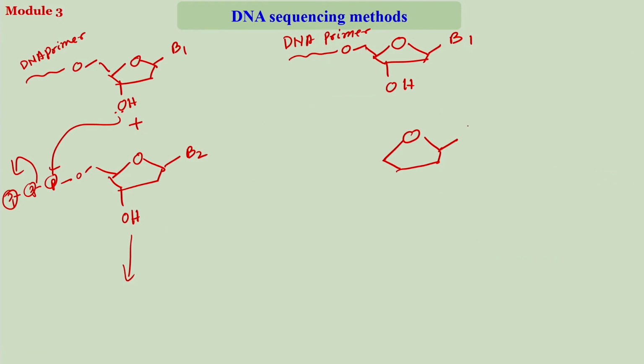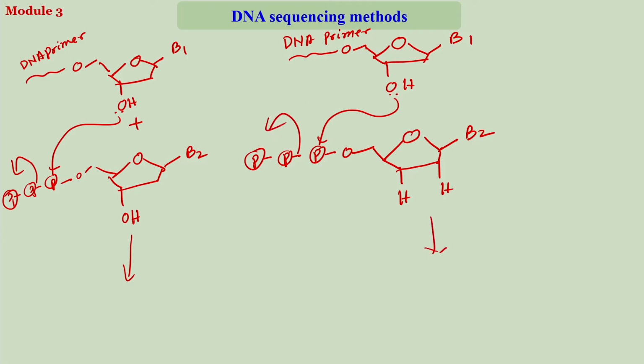So, back here, B2, here as usual you have the phosphate, and here you have 2 hydrogen. Catalyst, you use the polymerase, it is the same reaction as it goes, and there will be this formation of the phosphodiester bond here, one base would be attached. What next? This does not have a free hydroxyl group at the 3 prime end. Since this does not have a hydroxyl group, it cannot do the further process. So, it will stop the replication.